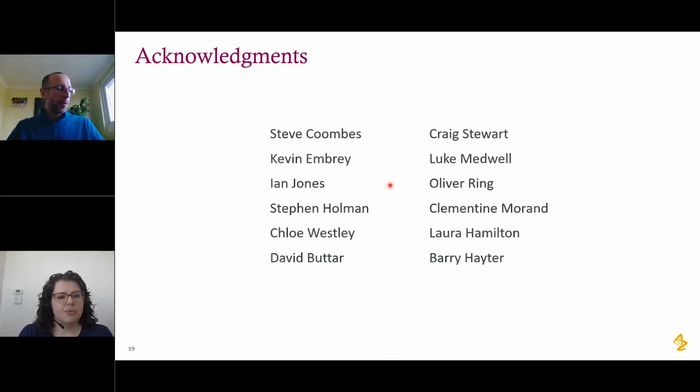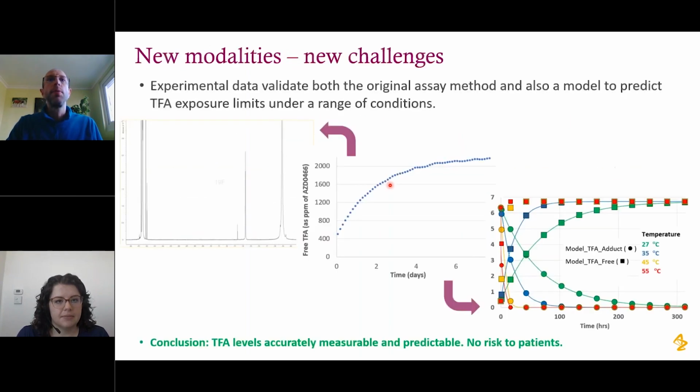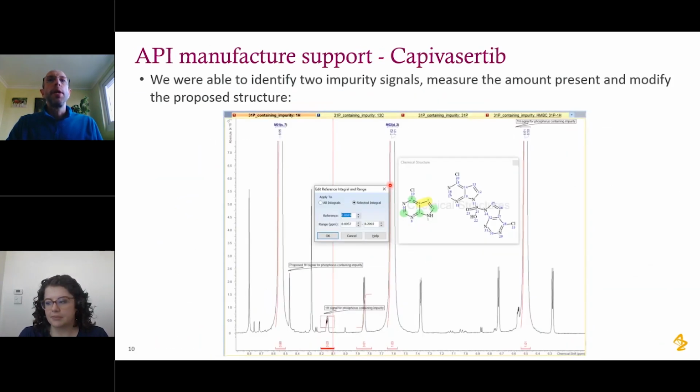With respect to the freeze dryer example, using fluorine NMR there had a clear selectivity advantage, but what were the implications in terms of sensitivity? Okay, yeah, that's a really good question. Let me go back to my introduction slide.